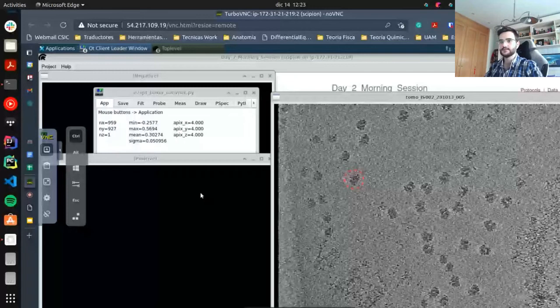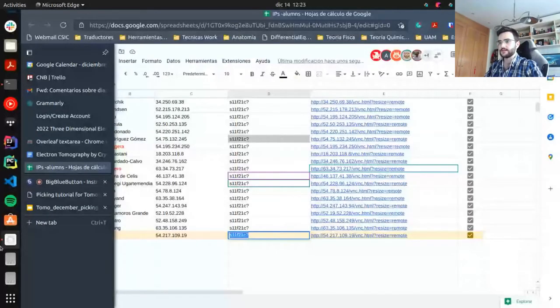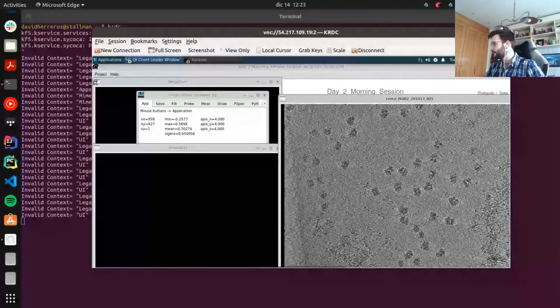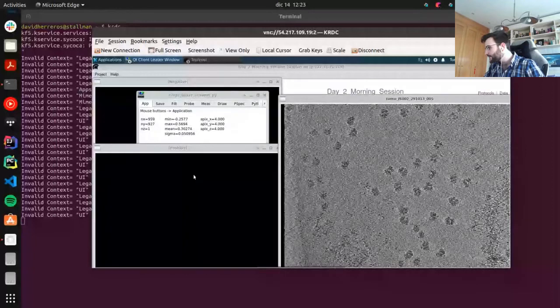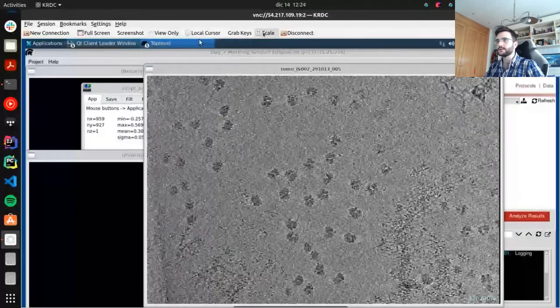Thank you, Pablo. Okay, I'm going to close the TurboVNC. And I'm going to move the chat to the other window, 1 second, so I can read you at the same time. Yeah, Control plus left click on the mouse for negatives.